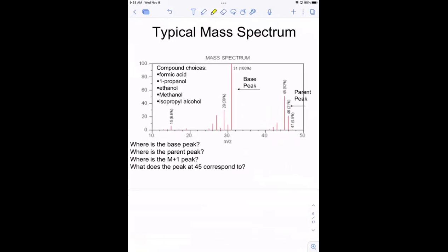So what's the first thing you would do? I'm just asking this to see where your mind is right now. What's the first thing you would do if you have 5 compounds and you're doing a mass spec analysis of each of the compounds? What's the first thing you would want to already know before you do that? The mass, the weight of it. Yeah, atomic mass. You need to know what the molecular weights of each compound are, right? Before you go and start injecting stuff. So let's look them up.